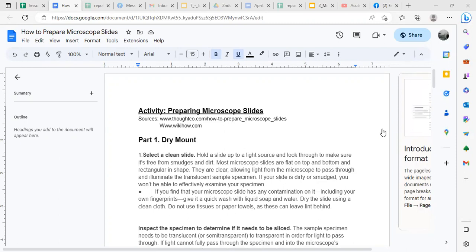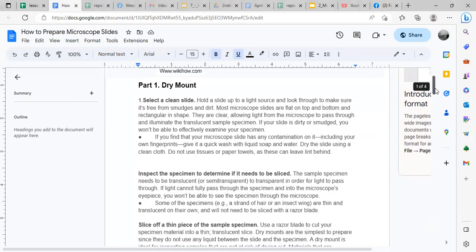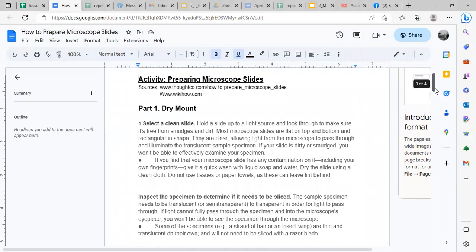So the coverage of the lab is just small. First will be the parts of the microscope, how to use the microscope, and then the staining techniques. All of that is in the second PowerPoint. Okay? And then also the pictures, pictures of the different organisms. And then this last one, how to prepare a slide.